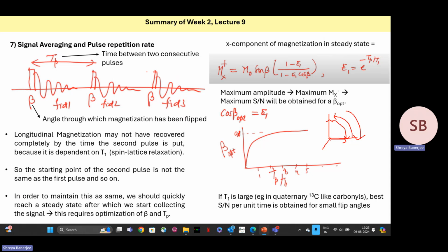It is very important that the magnetization goes back to the equilibrium condition and only then we apply the second RF pulse. Again, we let the FID completely decay to 0 and only then we add the third RF pulse. Otherwise, one FID and another FID will merge and it will be very difficult to separate them.